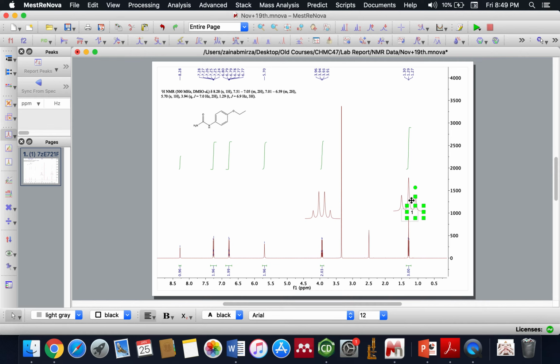So I kind of like to make it very neat. So since it's coming in my way, I'm just gonna move it a little up. I can make it smaller too. Okay, and the number can go right on top of the peak. Yeah, sometimes it's a mess. Okay, and then I'm just going to keep pasting this. And this is my peak 2.